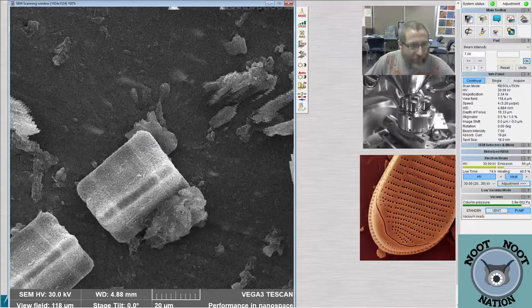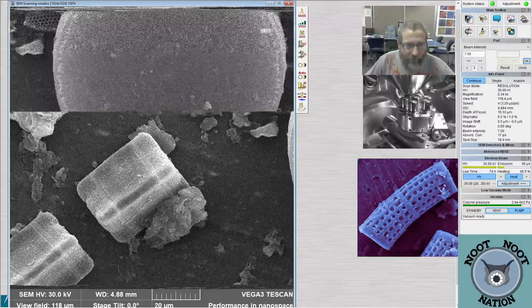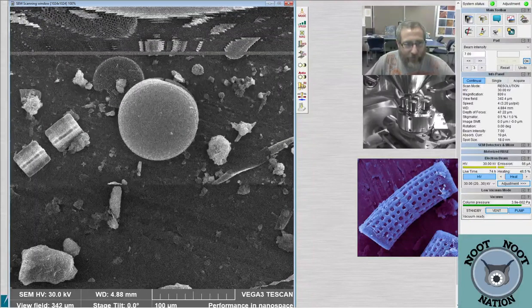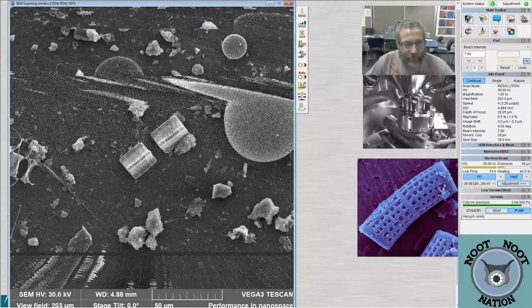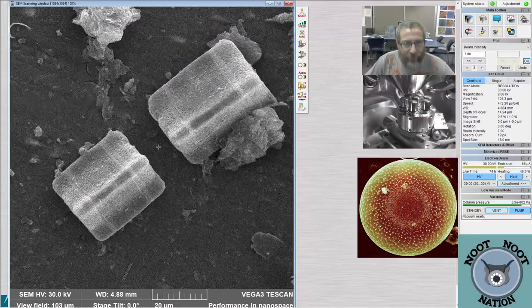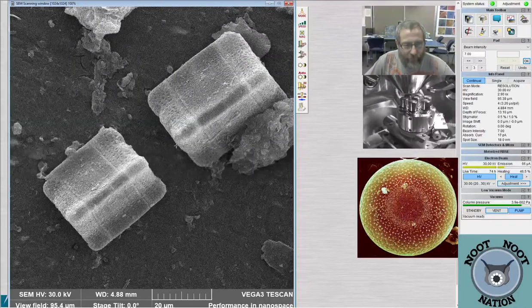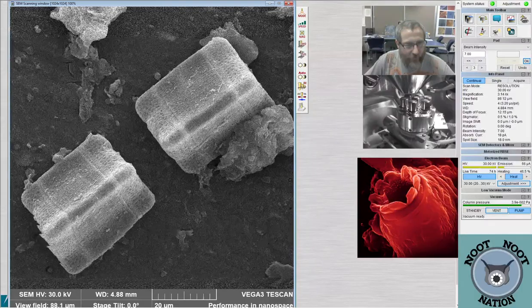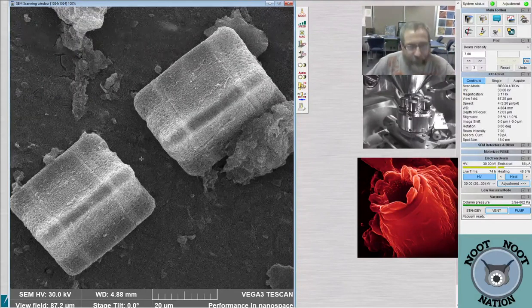Yeah, I don't know what that is, but you can definitely see that it was in a colony. Oops, I went a little too far again. Yeah, there's a link together. SEM's being kind of crazy. Yeah, they were somehow linked together when they were living. We can take a nice picture of them, and then we can try to see if you can figure out what they are. They're in girdle view.